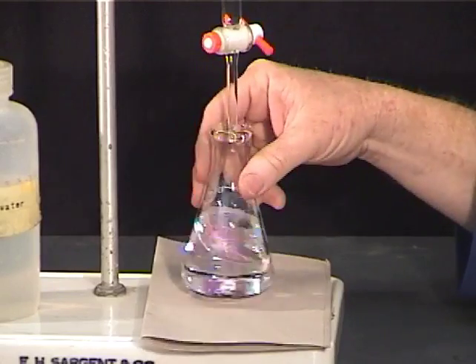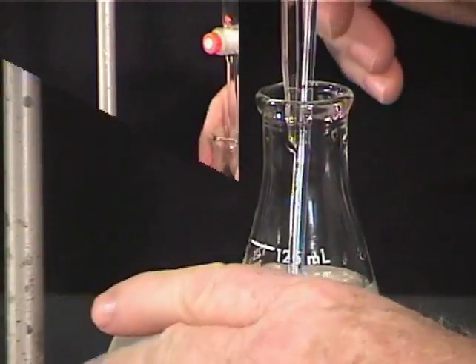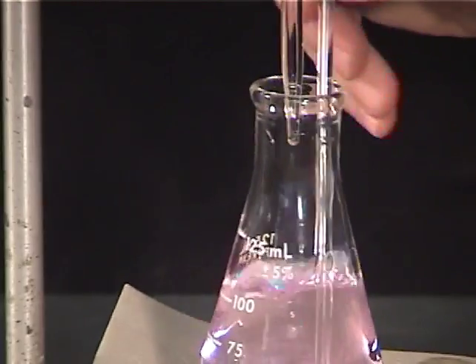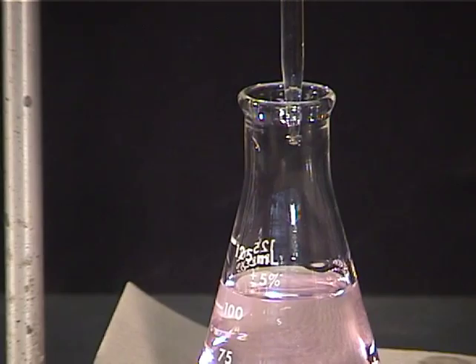At the very end of the titration, you can add a split drop by touching a hanging drop of titrant on the nozzle to a stirring rod, then stirring it into the solution.